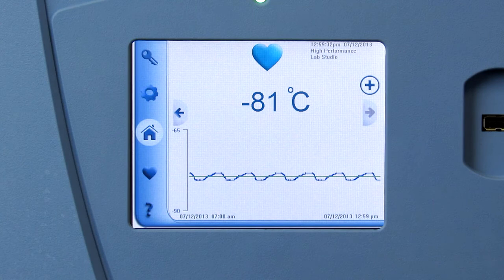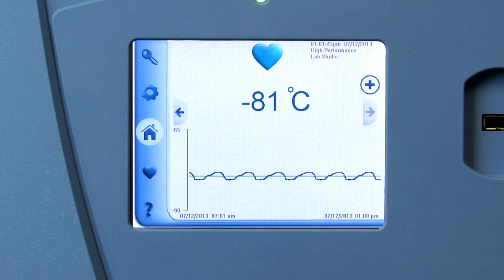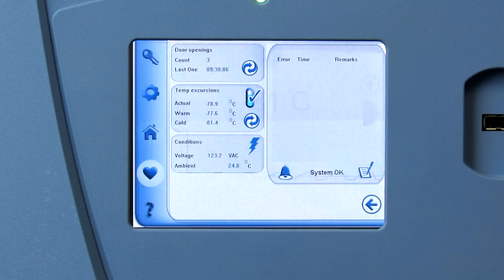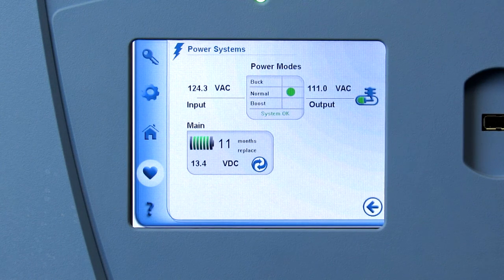The batteries should be changed once a year, and the system will place a message on the screen to notify you of the annual event. To view the battery status, touch the heart icon and then touch the lightning bolt icon to access the power system screen.